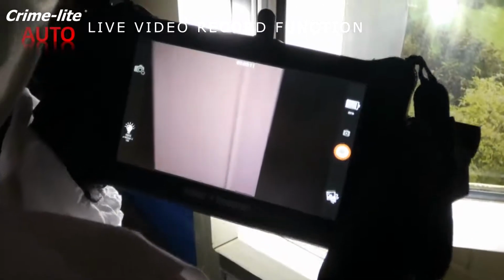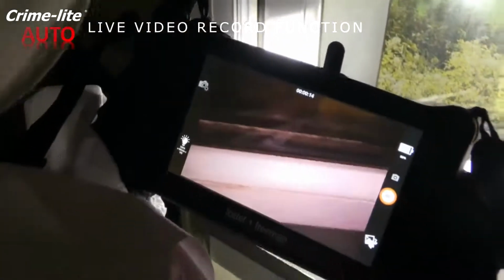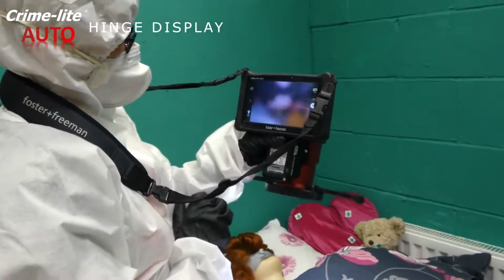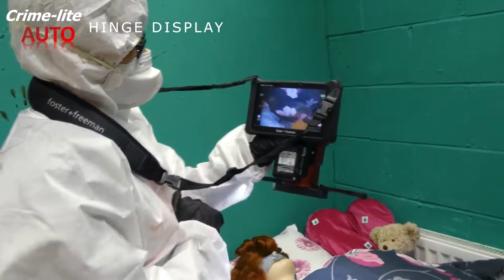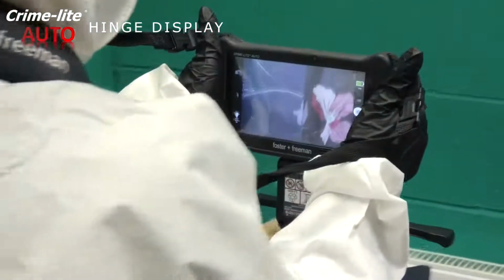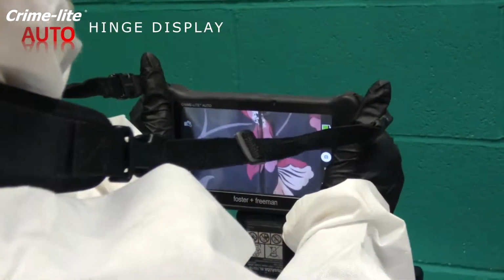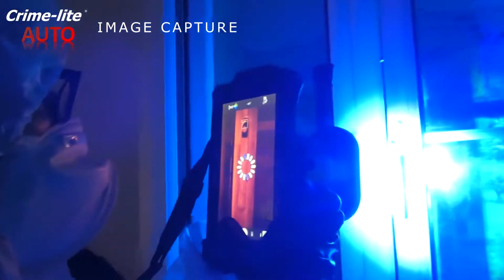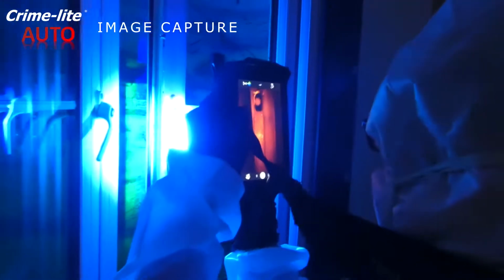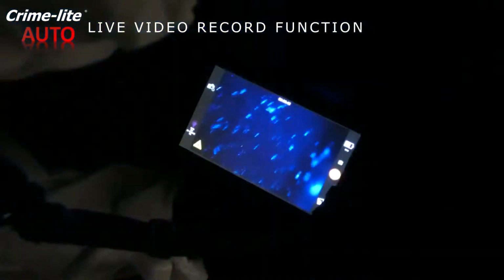So why is searching for fibres so important? Types of trace evidence like hairs and fibres can provide information about whether or not there has been any physical contact between different individuals, or whether or not someone has been present at the crime scene. With any form of physical contact, we might be looking at cases like sexual assaults, where we're looking for hairs, fibres, either at the scene or even on the victim. At the crime scene, fibres from someone's clothing may be left there. For example, it may be found on the glass or around the point of entry in a burglary, such as a window. But before we recover them, first we have to find them.